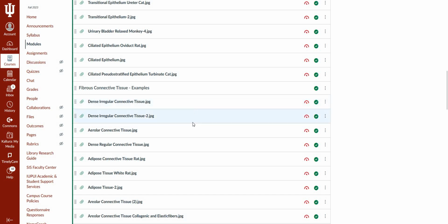So this name refers to its function. Elastic connective tissue is really good at expanding and recoiling. So we're going to find this in the arteries, specifically the muscular walls of the arteries. We also find it in vocal cords. So the way vocal cords work is they vibrate back and forth really quickly to produce sound. And we need this elastic tissue to allow that expansion and recoil over and over and over again. One last place we'll see them is in the vertebrae. So elastic tissue helps to stabilize the vertebrae. We unfortunately don't have any microscope slides showing that, but it's just a really cool relationship.